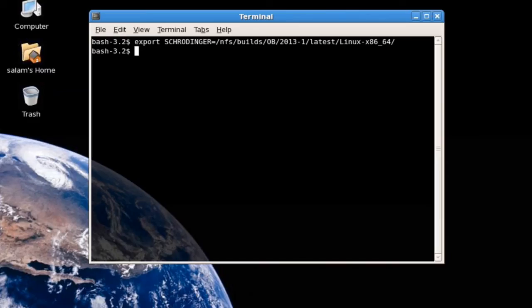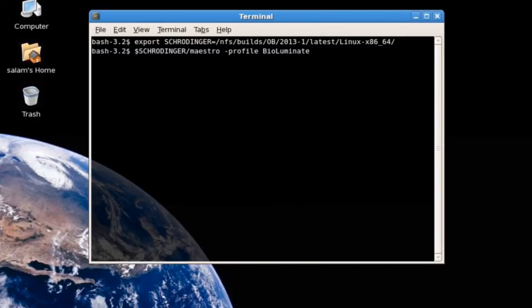You can also launch BioLuminate by default with $Schrodinger/Maestro -Profile BioLuminate.